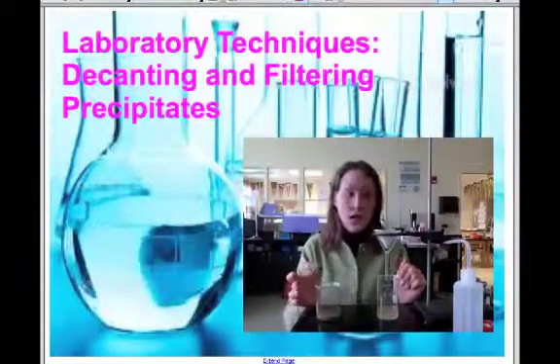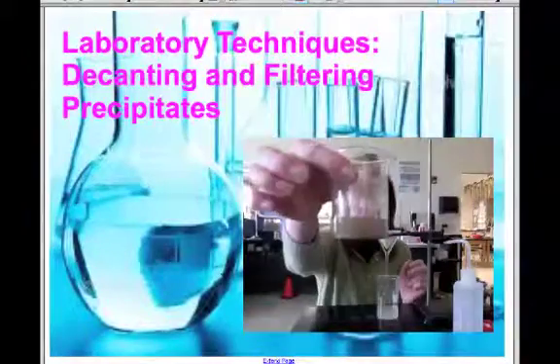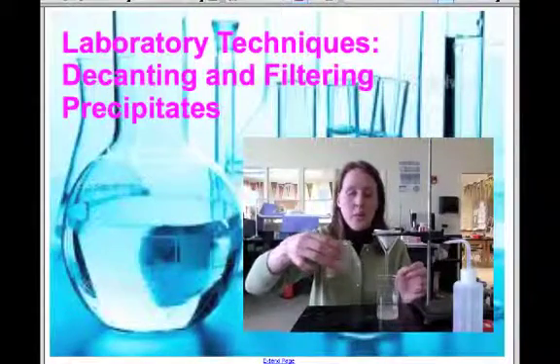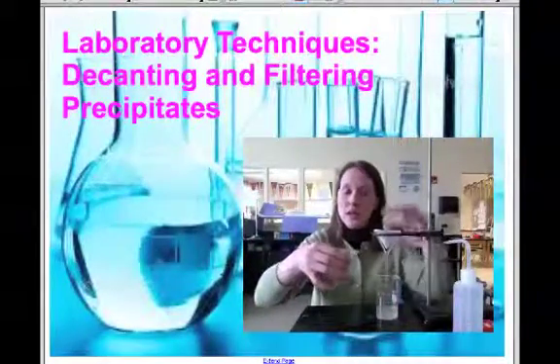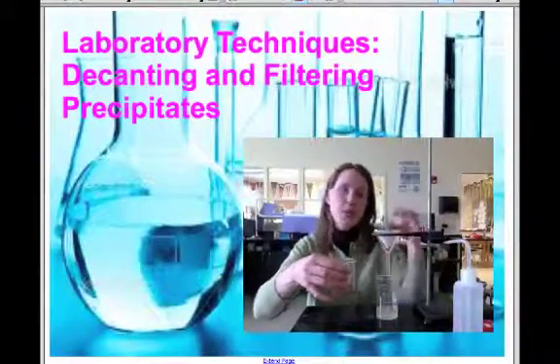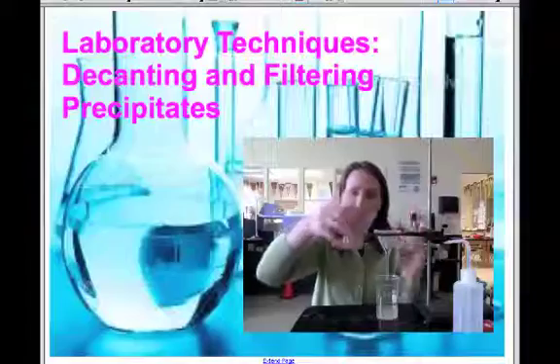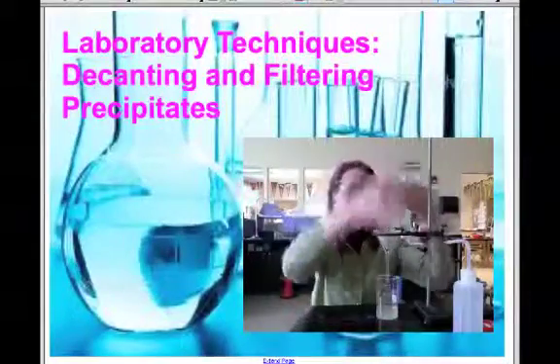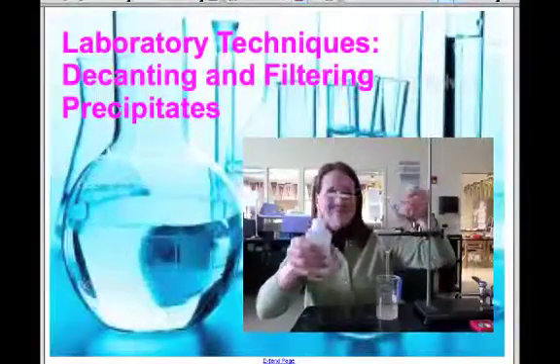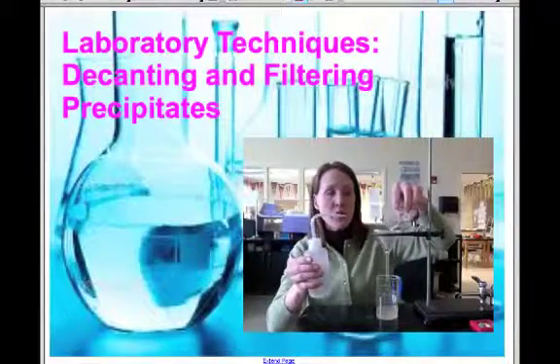Now for this, it's not necessary to use the glass stirring rod. You can swirl your beaker, once again, full of lovely sand, or in your case, silver. And the reason we don't do this, you'll see as you do this, it takes a long time. It's very slow as it filters through the paper, and you don't really want to have to put a lot through it. So I'll be just putting some more through it, and you can try and get as much as you can out. But I didn't do a very good job. So what doesn't come out, you will need to rinse with water in order to put it through the filter paper.